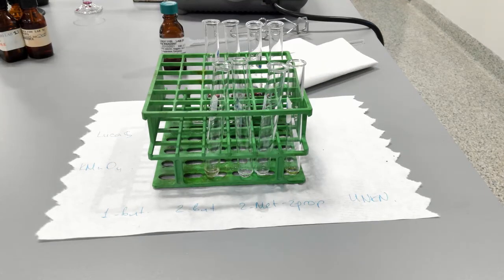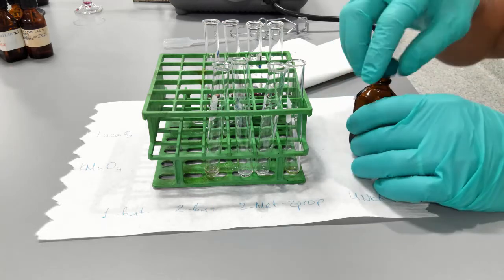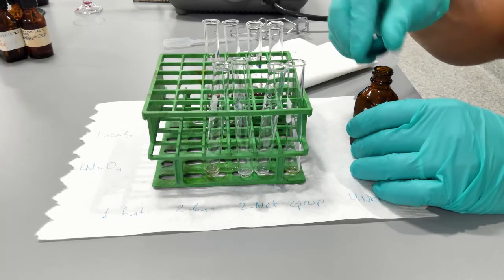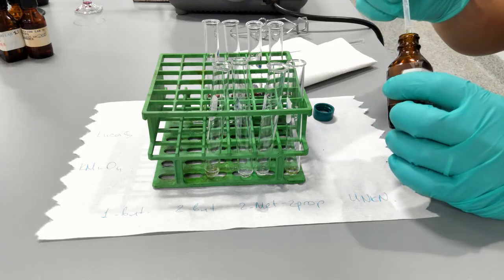Now here in the first row I have 4 test tubes with all 4 alcohols, and now I'm going to add 1 milliliter of Lucas reagent and check for cloudiness.